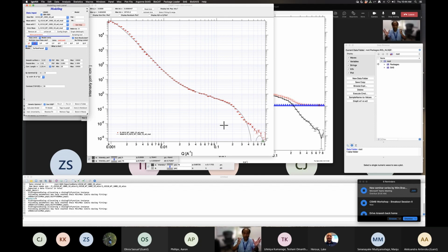Because the plant cell wall is not a single component that has a building block that assembles. There are many, the polymer can be in different ways, and the cellulose can be different. So that's your cylinder part, and that's your larger particles. The larger particles have a smooth surface, and their rough size is closer to 1200 angstroms. At least that's the lower limit, right?